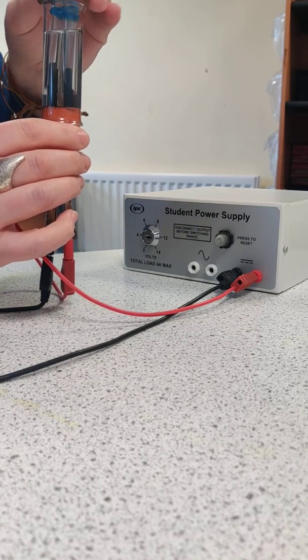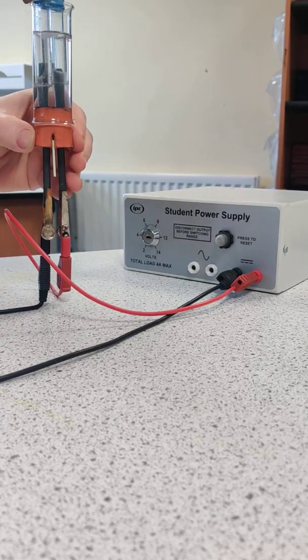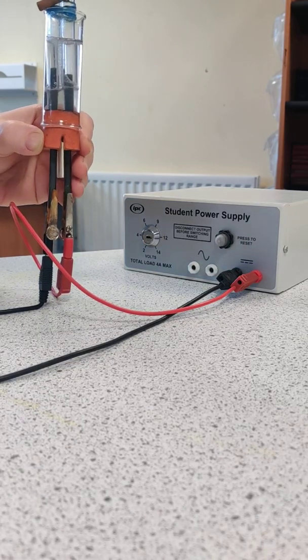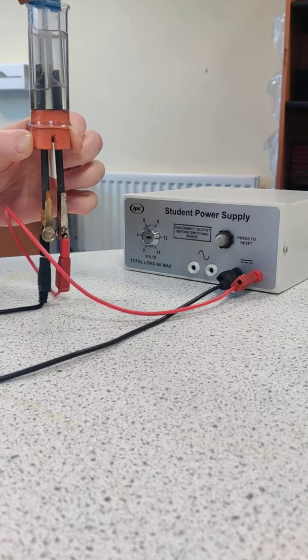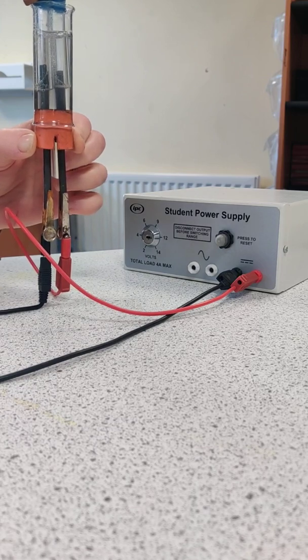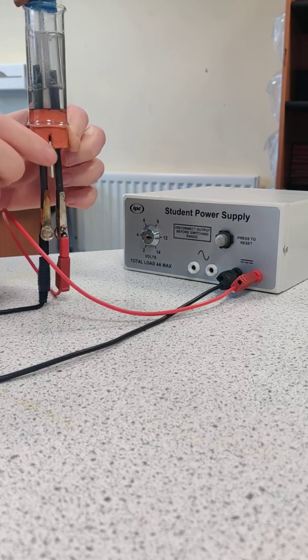Just let some liquid go in there. Again when it's switched on both electrodes are fizzing. The gases can be collected in these tubes and we could test them — we would see a squeaky pop from a lit splint with hydrogen, and the oxygen would relight a glowing splint.